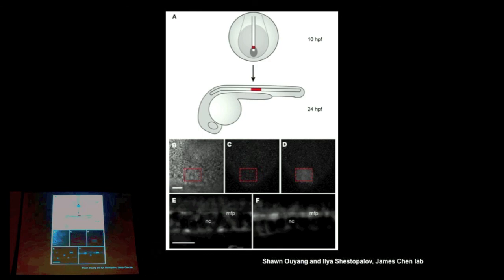Exactly how big the beam is, is determined by the objective. That's the same as the resolution of the objective, which is exactly determined by the point spread function, which is how the light is focused down to a spot. So that's both the resolution of your imaging technique and the size of the spot that the laser is causing. It is exactly the same thing.